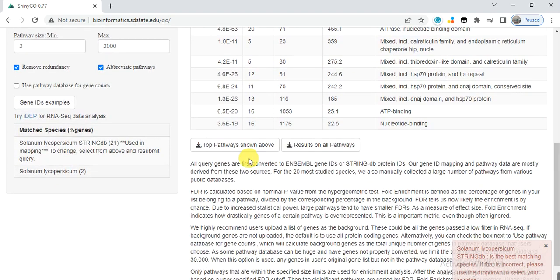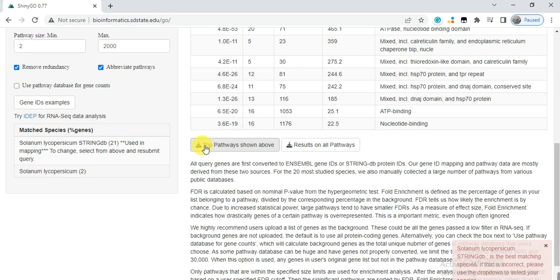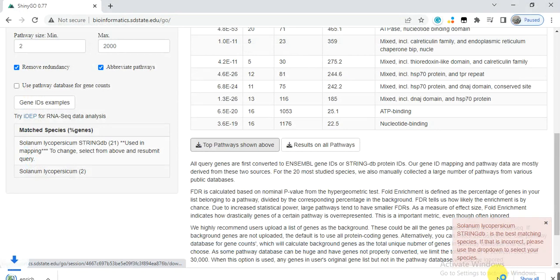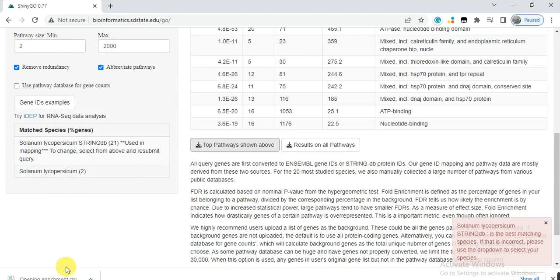You can download this information and save it into your destination folder so you can open it to check.